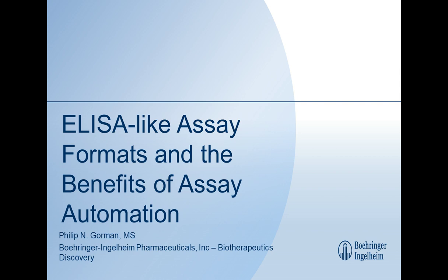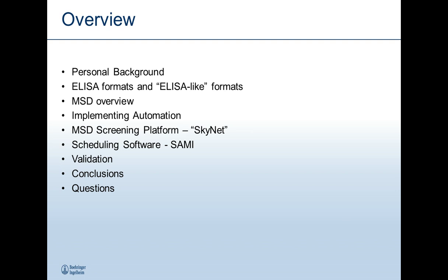Thank you, and thank you for joining us all today. I will be presenting today's webinar on ELISA-like Assay Formats and the Benefits of Assay Automation. As a brief overview of what we're going to be talking about today, I have a couple slides on my own personal background and background of my employer, Boehringer Ingelheim. We'll go through a recap of the standard ELISA formats that most scientists are familiar with, and then some, as I refer to them, ELISA-like formats that are derived from this overriding principle.